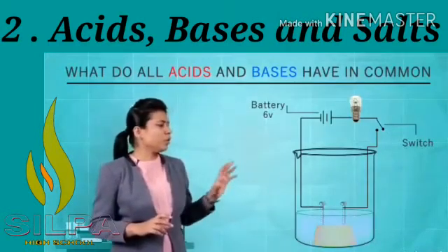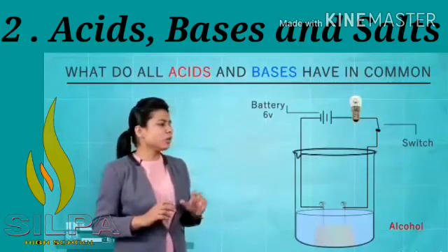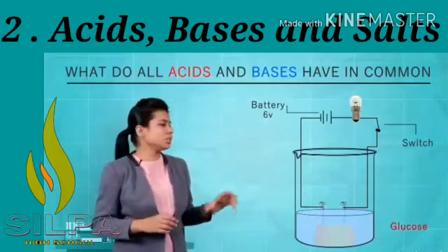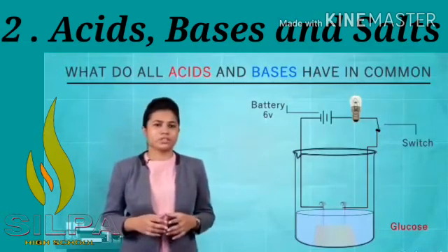Now when we pour alcohol into the beaker and turn on the switch, what do we see? It does not conduct electricity. Now let's see with the glucose. We put the glucose and again it does not conduct electricity.